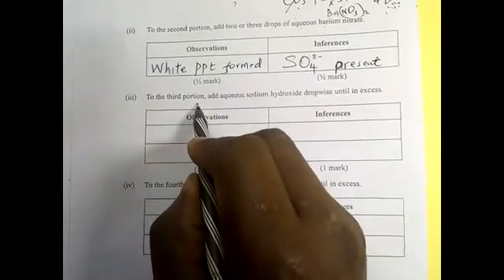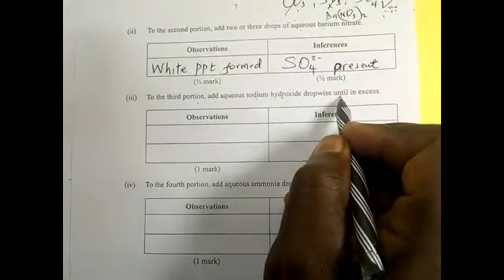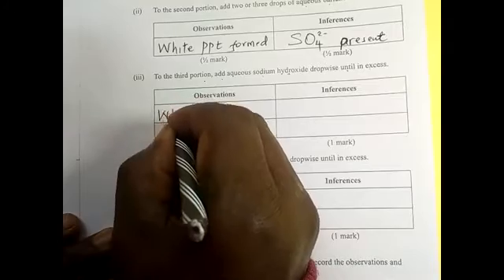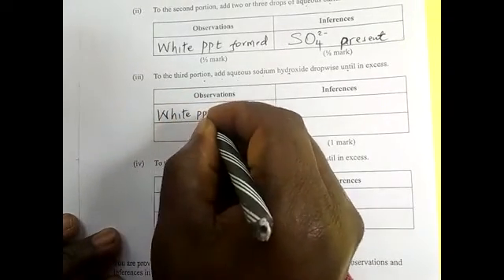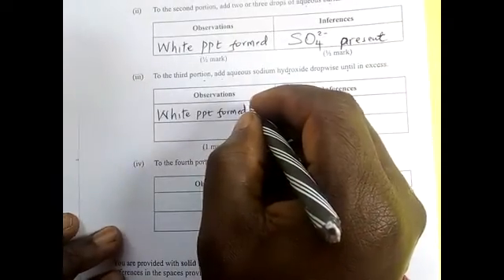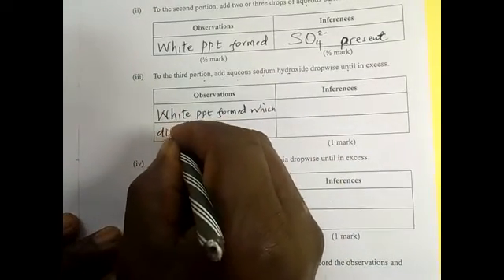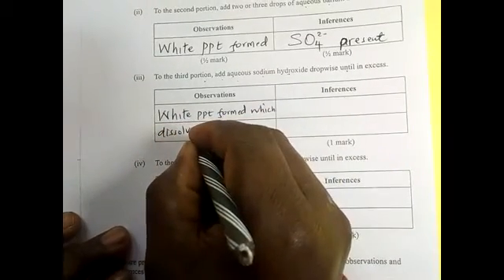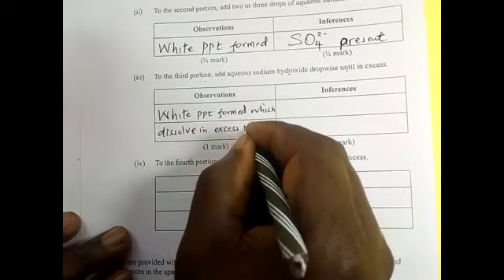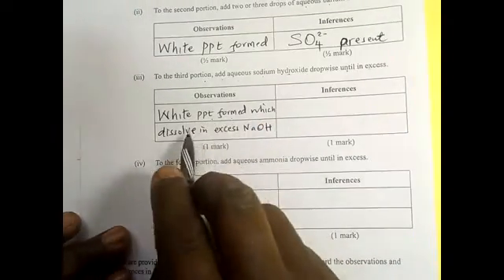To the third portion, add aqueous sodium hydroxide dropwise until in excess. So here a white PPT is formed, which dissolves in excess sodium hydroxide. A white precipitate is formed which dissolves in excess.